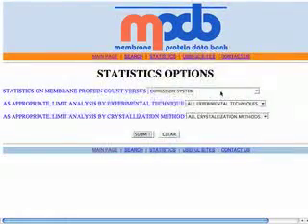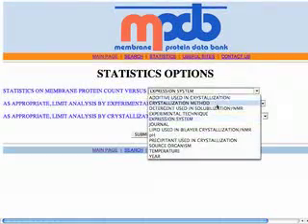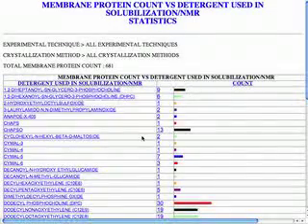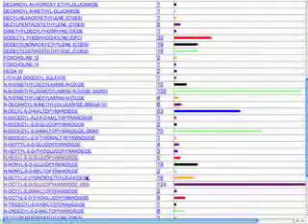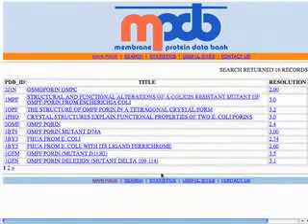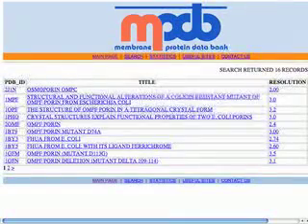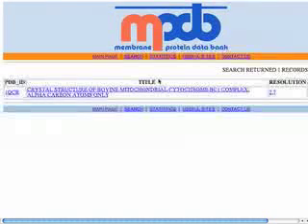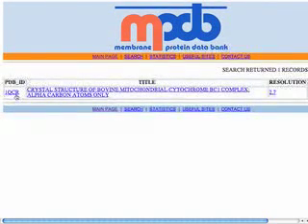Let's go back and look at a few more interesting statistics — one of them is the detergent used in solubilization or in the actual NMR experiment. Looking through this gives you a very good list of detergents and the frequency of use. We can see that octylglucoside is a very commonly used detergent. Clicking on the number gives me a PDB ID of all those structures that used that detergent. So if I do want to screen any particular detergent, I can get very precise information on how the people who crystallized, say, 1QCR — the cytochrome BC1 complex — used this particular detergent.